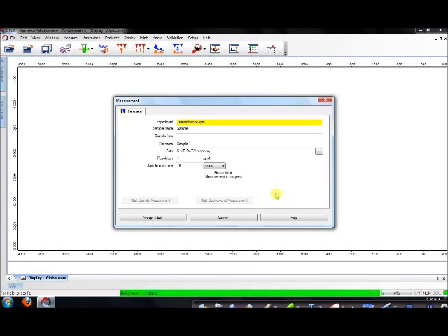Make sure that at this point of time, you have no sample in the machine. This is to allow for the background scan, which is just air. If it's all good, you can start by clicking Start Background Measurement.